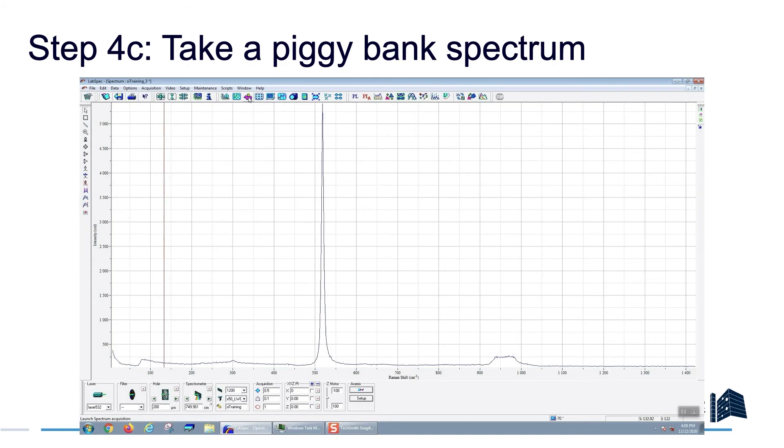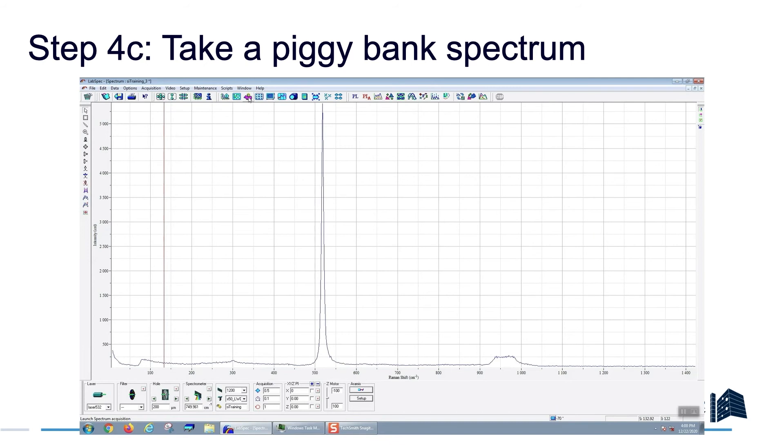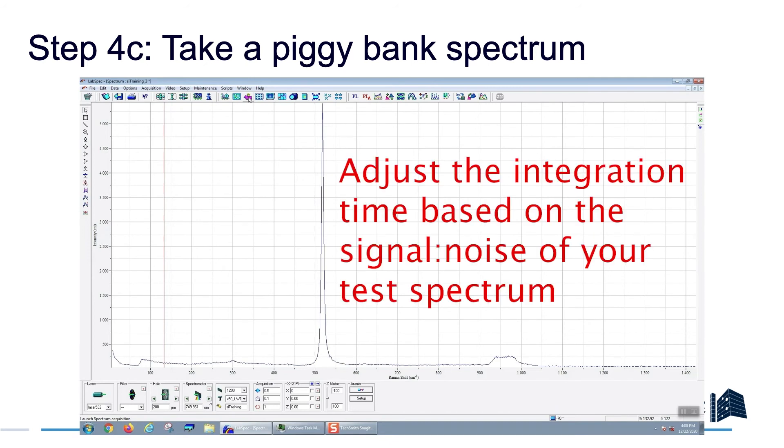Taking a piggy bank spectrum is a really good idea because it lets you know exactly what the instrument will do at every pixel. For example, if you forgot to turn off extended range mode or if you forgot that you were averaging 10 times, your piggy bank will do this and let you know. It's also important because when you take such short acquisition times, then you'll see what the signal to noise of your spectrum is. If that's not sufficient for your purposes, then you know that you need to actually increase the integration time. Conversely, if you have a lot of signal, then you can probably reduce the integration time so that your maps don't take as long.